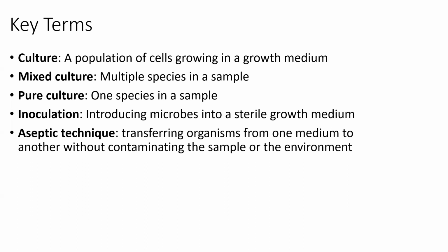Now in this class, normally at the beginning of lab, I would give everyone the bacteria that they would need for that day's class. So you might have test tubes of E. coli, you might get test tubes of Salmonella or Shigella or whatever. And I would say, okay, these test tubes have bacteria growing in them. I need you to put some of that E. coli onto an agar plate. Or I need you to take some of that E. coli and inoculate this new broth media because we're going to test and see if it can metabolize this sugar.